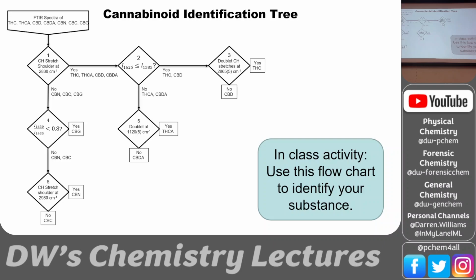So that's how it's indicated, 2980. 2980, right there. So it's straight down, it's this question right here. Yeah, you have to keep that.